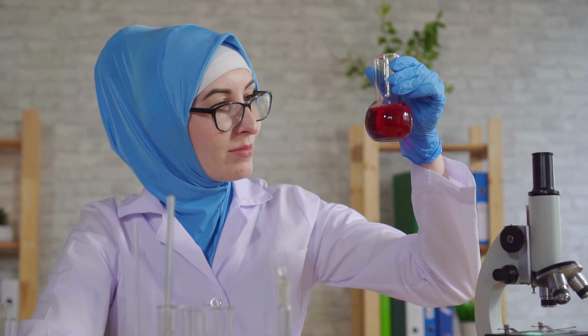Now some important points. The filter paper can only prevent particles larger than its holes, or pores, as we should call them, from passing through it. This means that anything smaller than those pores ends up in my conical flask. This looks reasonably clear, but is it pure? Well, no.